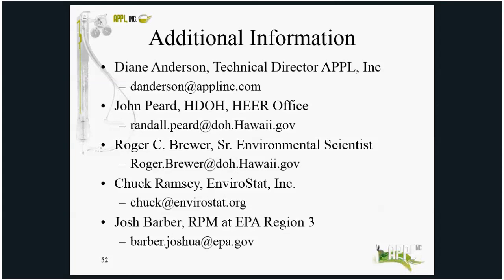Diane, I have a question for you. This is John in Hilo. Is it common when you do grind samples that you first analyze the 2 millimeter fraction and report both the 2 millimeter fraction level as well as the ground fraction level? You know, when we first started doing incremental sampling, we did that a lot. We're not seeing it as much anymore. We didn't see too much of a difference between the two, and with the grinding, we did get better statistical reproducibility, so most everyone in that instance has gone to grinding.